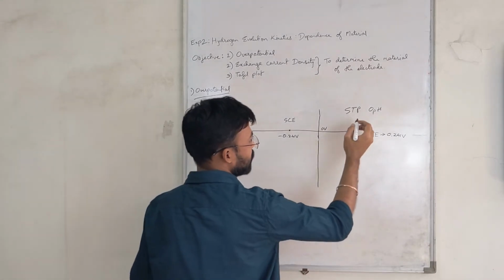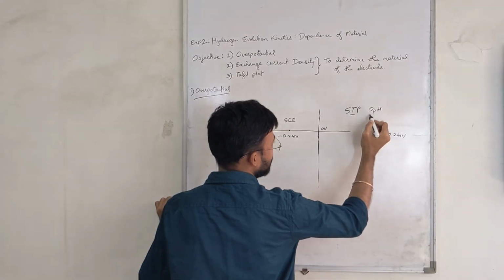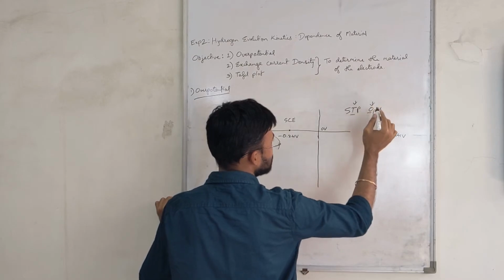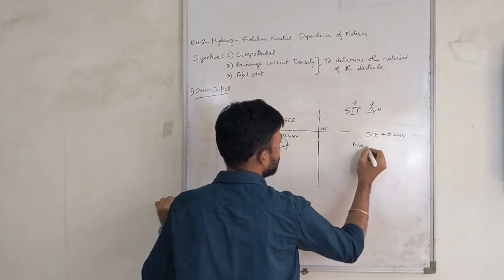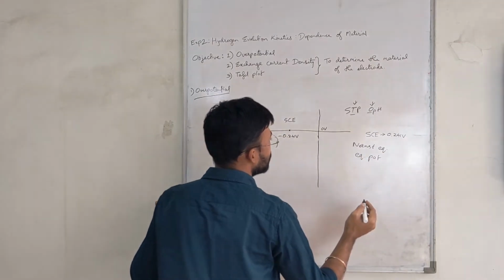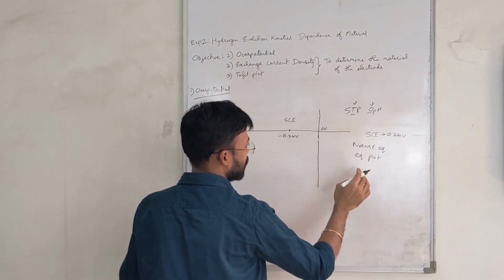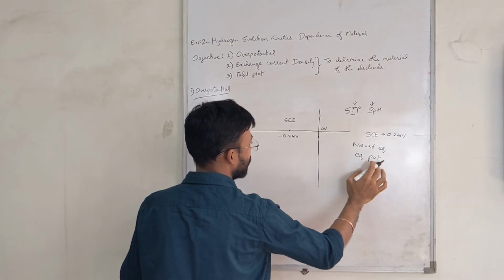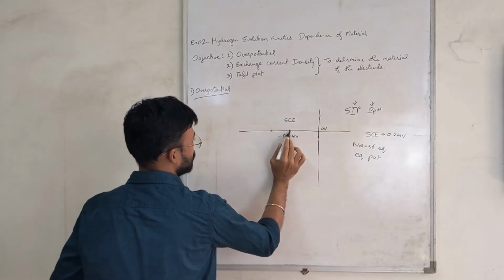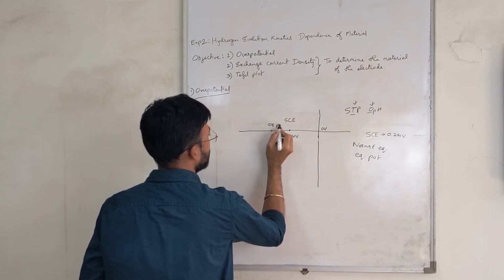But the place where we are conducting the experiment, the temperature is not standard. Also, the electrolyte that is given to you is not 0 pH. So to consider the effect of temperature and the pH, we will be using the Nernst equation to find the equilibrium potential. When you put the temperature and the pH of the electrolyte into this Nernst equation, you will get an equilibrium potential, and it will be somewhere more than the actual hydrogen evolution voltage. So this is the equilibrium potential.